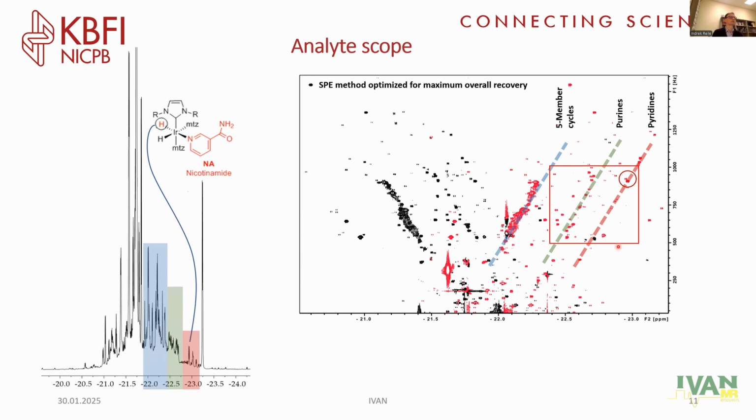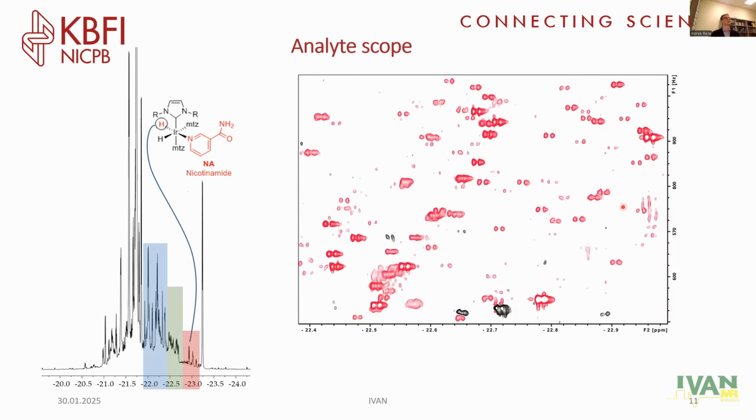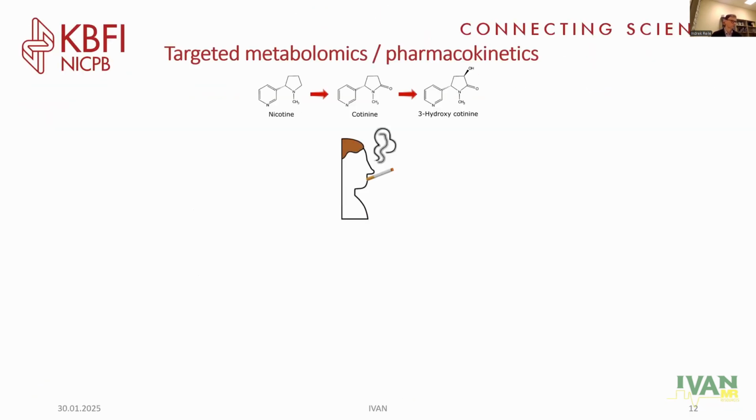And if we zoom into this red box, you can see how many different complexes there actually are. It helps you appreciate how many different molecules we might be detecting, although we have to bear in mind that each of these doublets is not a molecule. Some metabolites may give multiple different complexes. But anyway, we're still looking at several hundred doublet responses here.